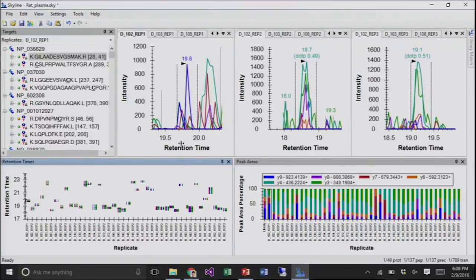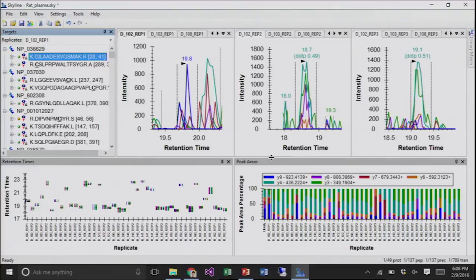What do people think of this? Do we think Daniela did a great job and this is a really beautiful example of a peptide? Nobody wants to say anything bad about Daniela, right? She did a great job. But this doesn't appear to be very measurable. Again, it's pretty different from the library, as somebody pointed out before.